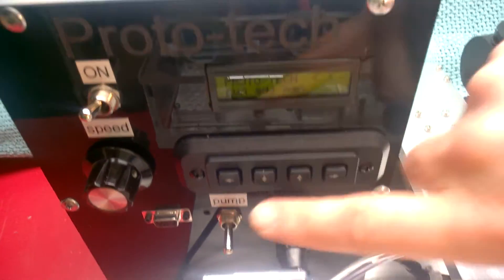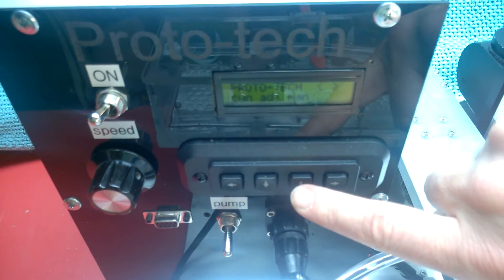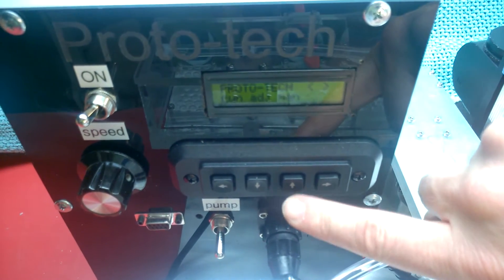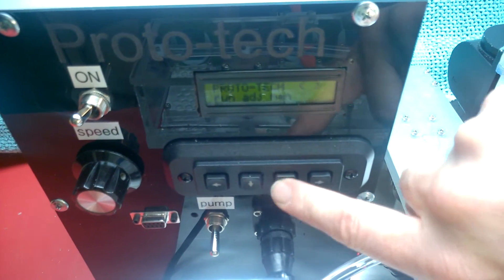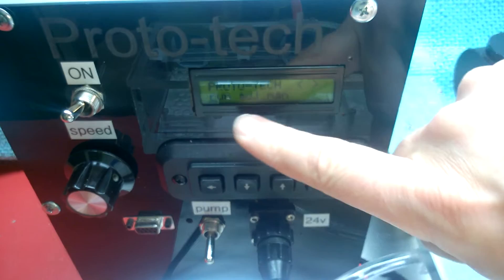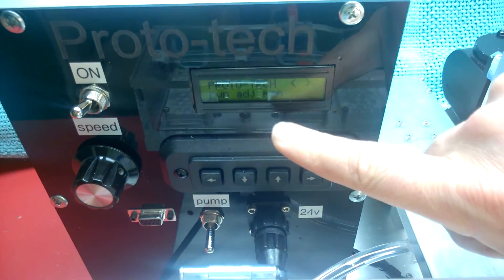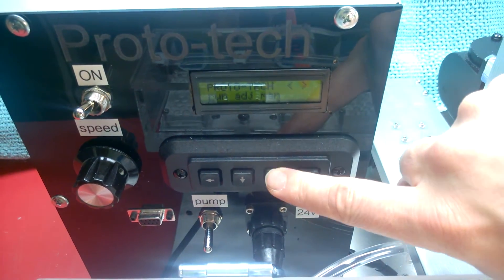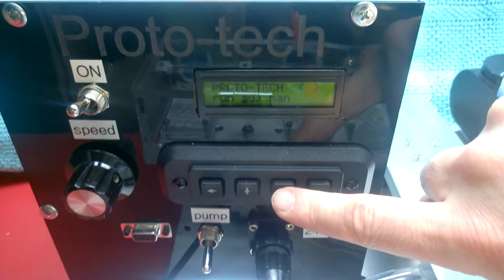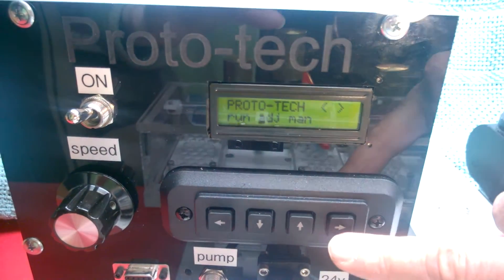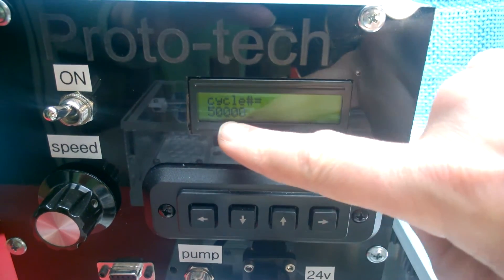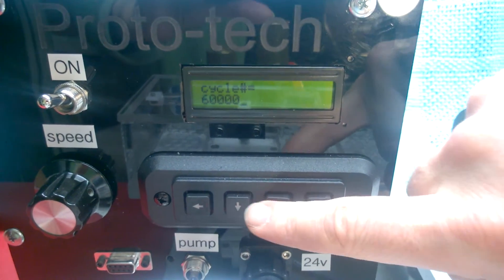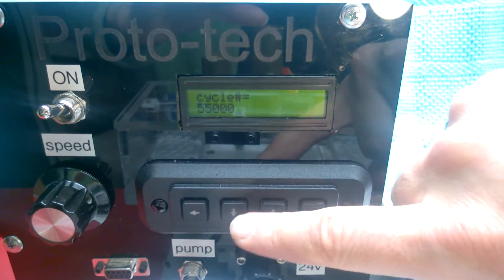We're going to start by hitting the, you see as you, on the keypad, as you hit these up and down arrows, it highlights these different elements: run, adjust, manual. So let's highlight adjust. We can go through that menu. You can adjust the number of cycles. It's going to go to an increments of 5,000.